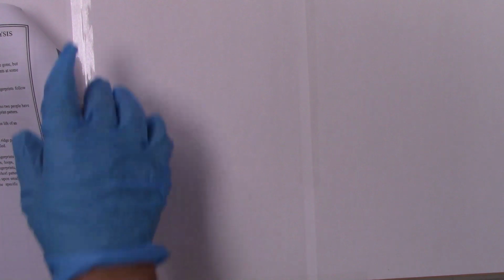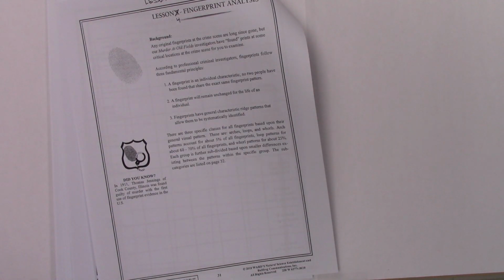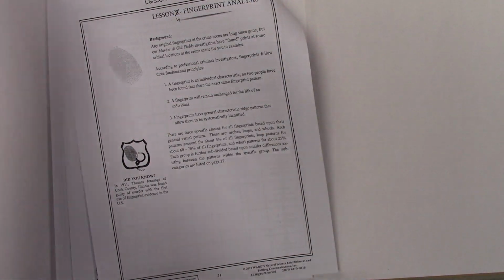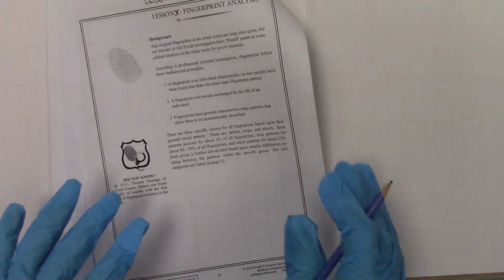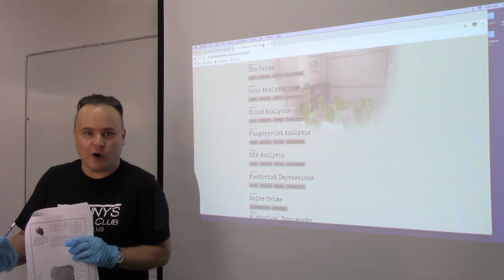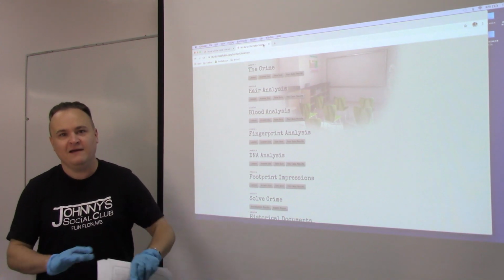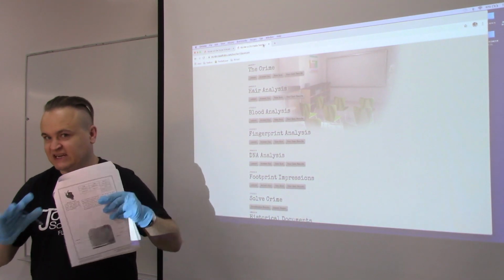Let's look down here. The reason I have gloves on is because this fingerprint powder here, I can't even touch it without getting everything dirty, but once you touch it, it goes everywhere, and it makes marks, and it's impossible to remove. So I've put paper down here because I'm going to just take the paper and throw it out. All of my equipment is covered in plastic wrap right now. It's like I'm actually trying to get away with a murder because I want to be able to just take everything off of my desk and throw it in the garbage with all the powder and dust everywhere because it's just such a messy lab.